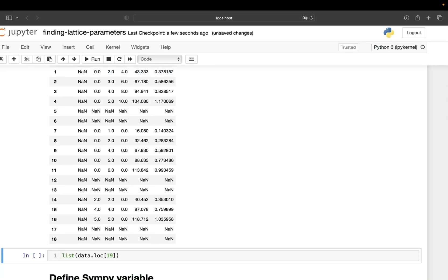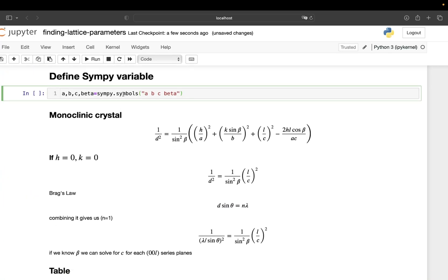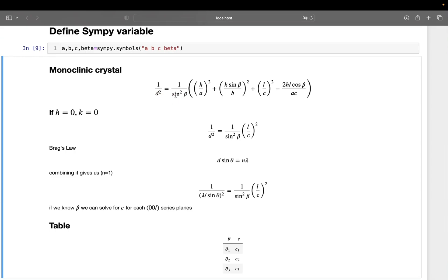Now for the theory behind this process: I define symbolic Python variables. You can find this formula online or in any X-ray textbook. For a monoclinic crystal, d is the separation between reflecting crystal planes for which we see constructive interference. In the formula, a, b, c are the lattice parameters and β is the angle between a and c.